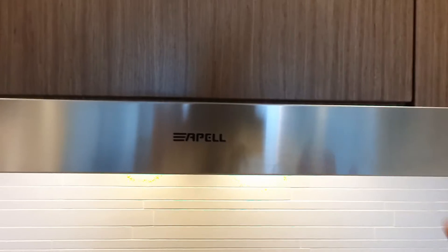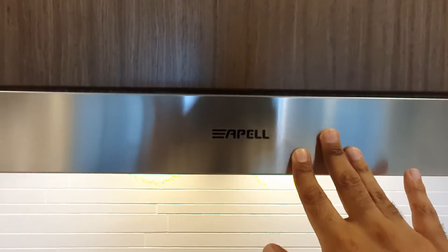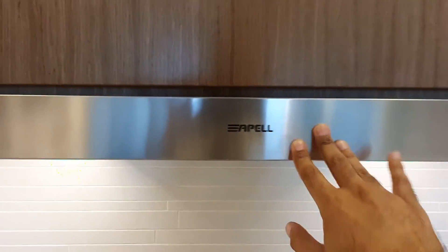When you switch it off, simply press it inside and it will be off.